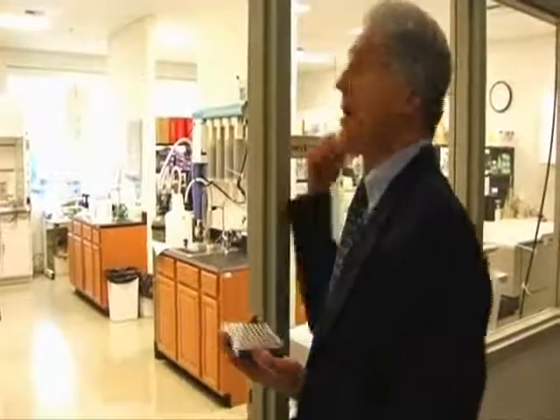The chip scanner behind me holds 200 of these and runs the entire analysis in about 1 day. So you can imagine the amount of data that is accumulated, and we're looking for what? We're looking for an alteration of gene expression produced by one of those plant compounds. That means that there is some effect at the DNA level.